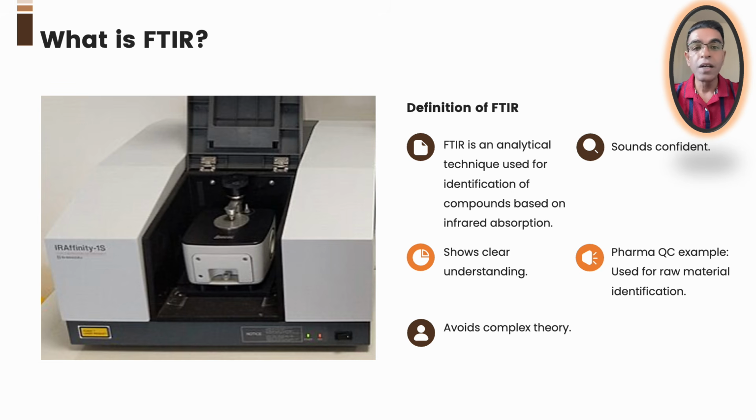And then you add one practical pharma line. "That's why in QC labs, we commonly use FTIR for raw material identification before dispensing, just to make sure the right material is being used." See, this sounds natural, confident, and interview ready. And once you say this, the interviewer knows, yes, you truly understand FTIR.